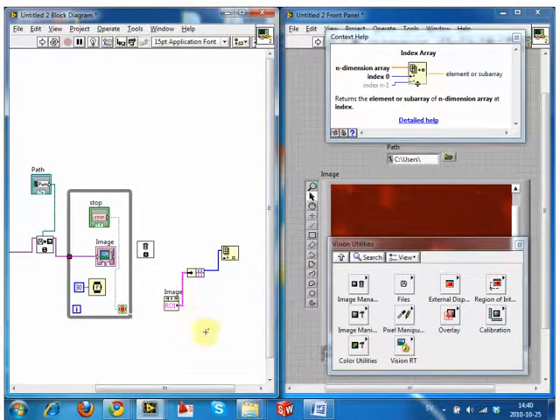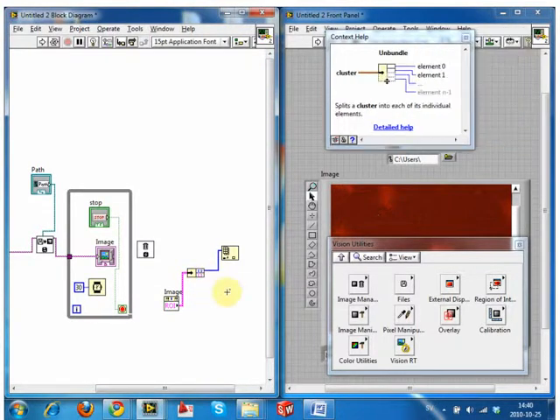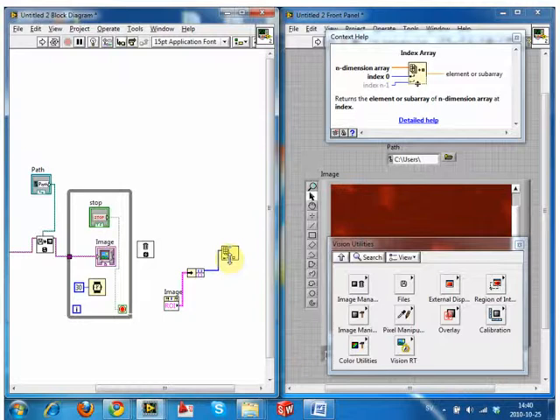And all it does is put them in a line. For example, if you have a box which goes from x1 to 1, 1 to 3, 3, then essentially you have a 1D array which says 1, 1, 3, 3. We need to split out this information, because right now it's just numbers in a line, and we need to index this line so that we can pull them all out. I've got 4 things there, yeah.